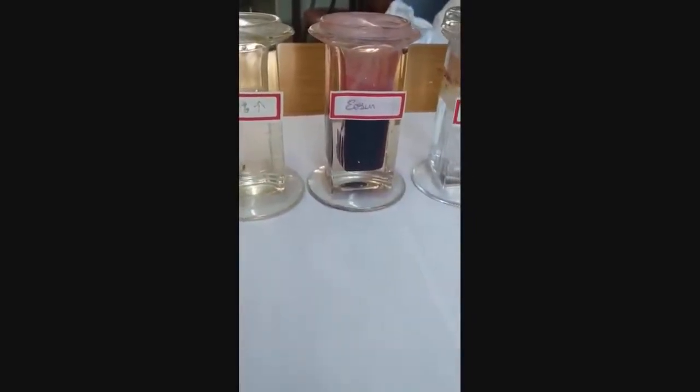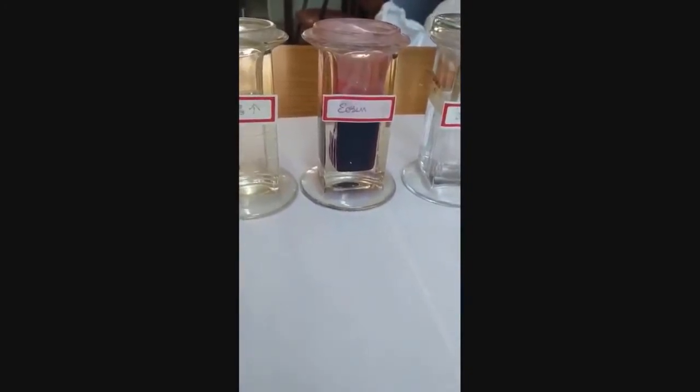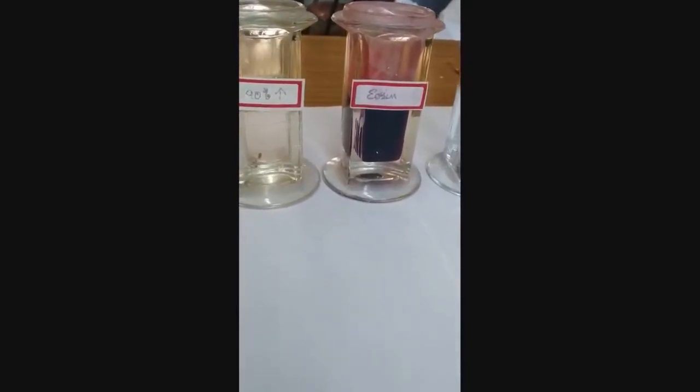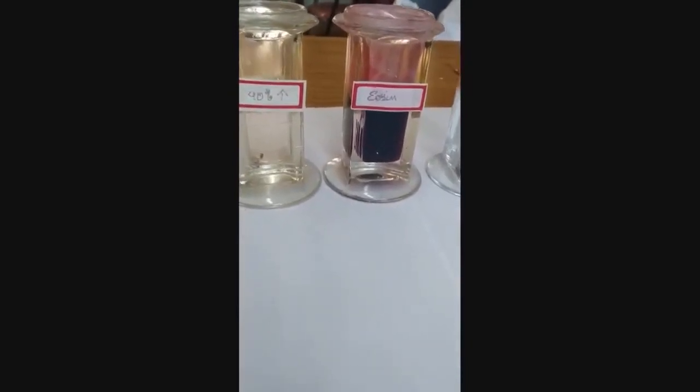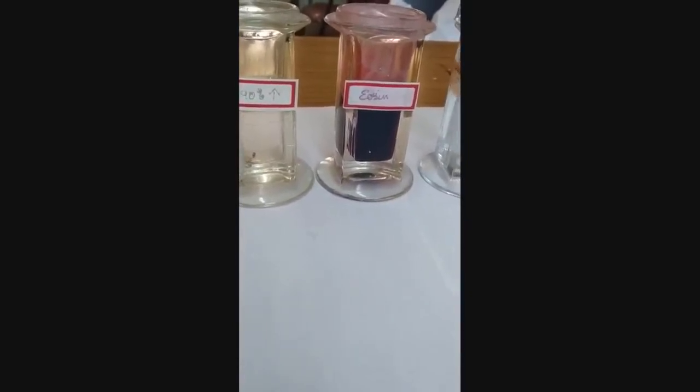Eosin is an acidic stain and reacts with basic components of the cell. Cytoplasmic proteins and other components in cytoplasm are basic in nature and hence they react with eosin.